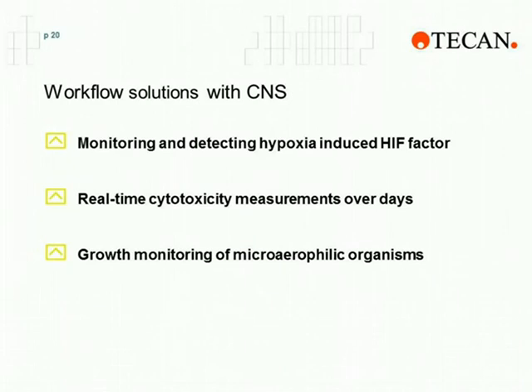Thank you for the polling questions and your answers. Now we're going right into the application sections with CNS, and we have chosen 3 examples to really show how beneficial CNS is in the assay workflow. We'll show monitoring and detecting hypoxia-induced HIF factors, a real-time cytotoxicity measurement over days, and the final assay is growth monitoring of microaerophilic organisms, and all these assays benefit from the CNS.